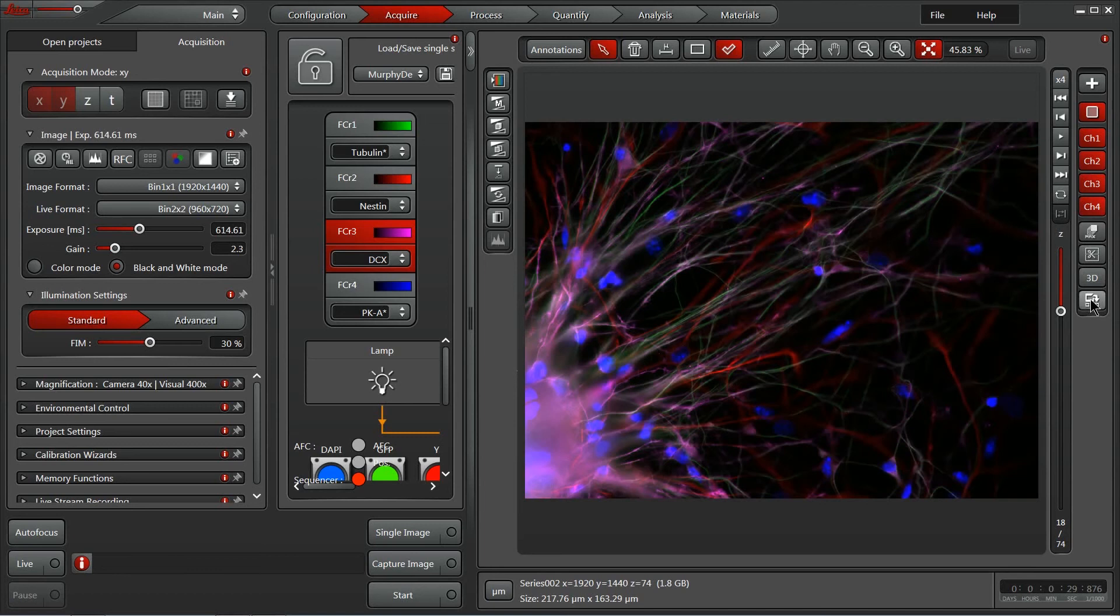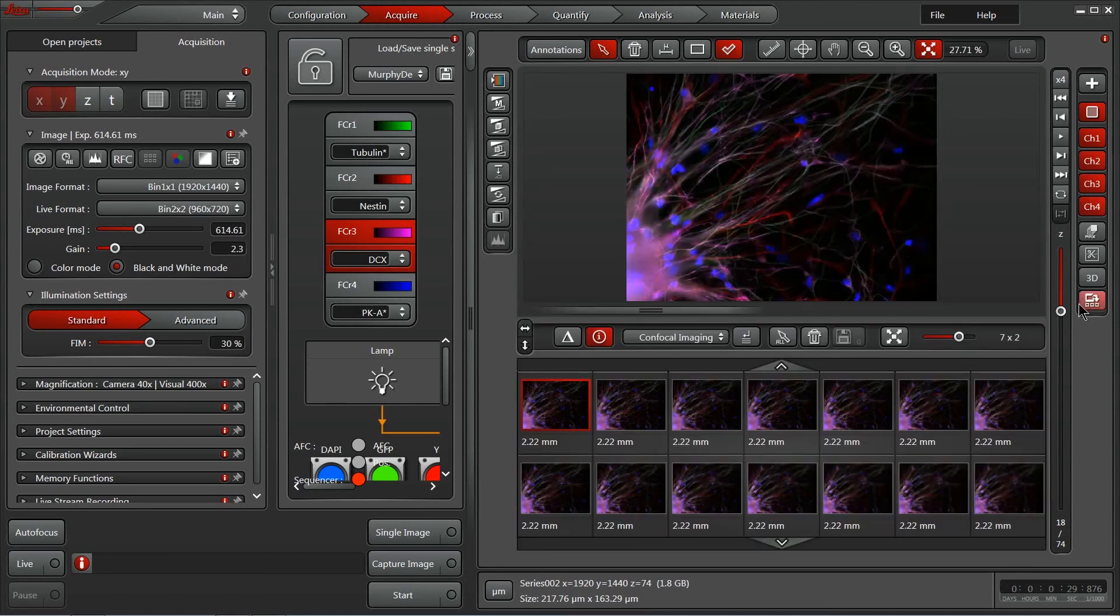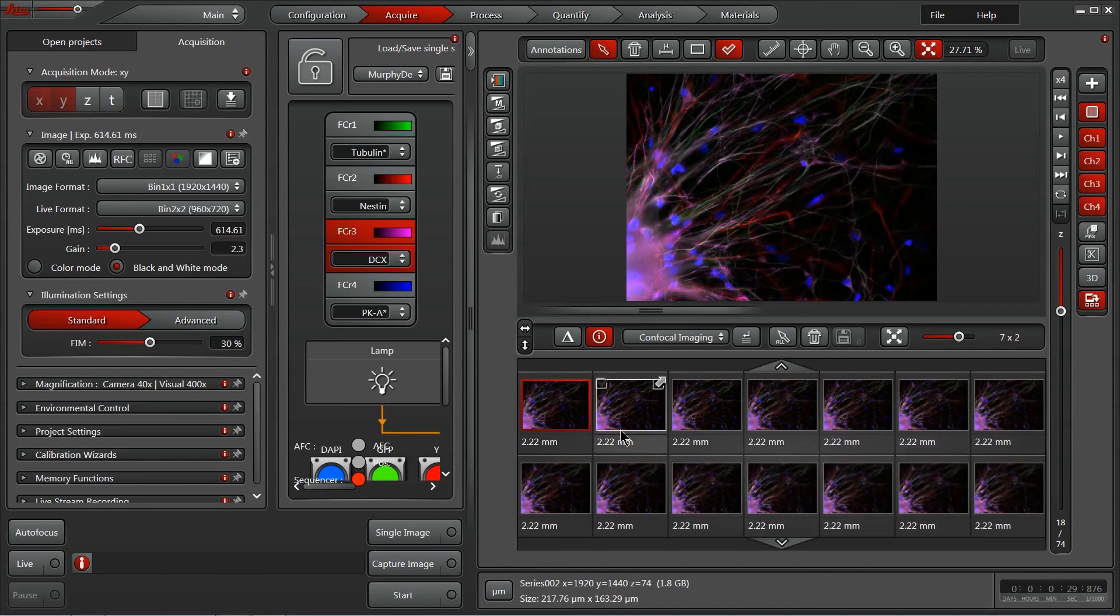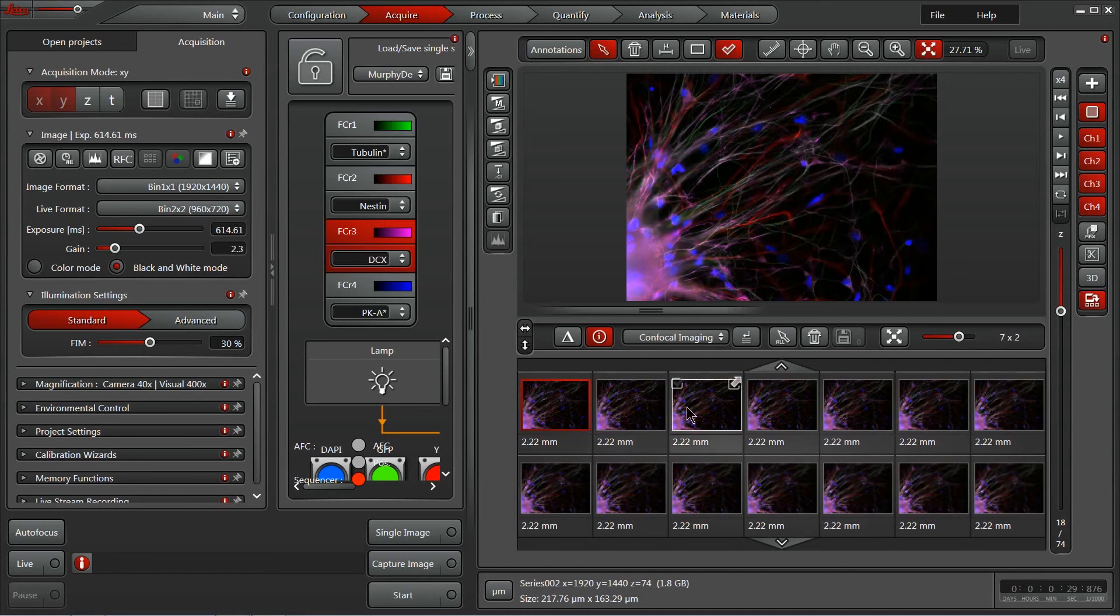And here at the bottom, we also have our multi-dimensional gallery, which is really nice if you've got large time lapses or big Z-Stacks where you can go through and pull subsets of that entire experiment out for analysis or demonstration.